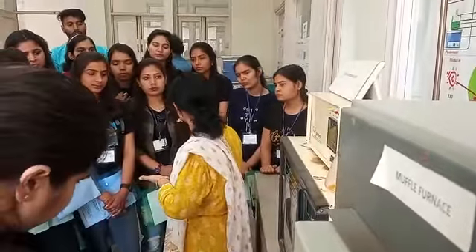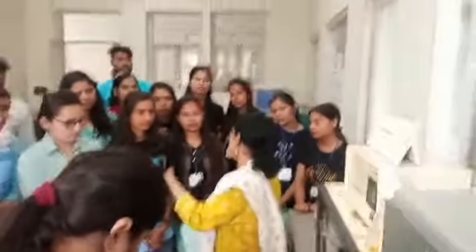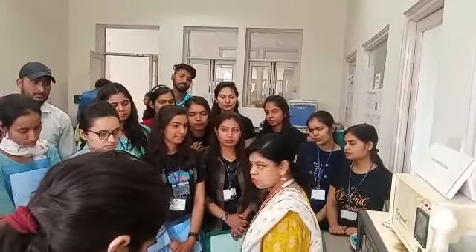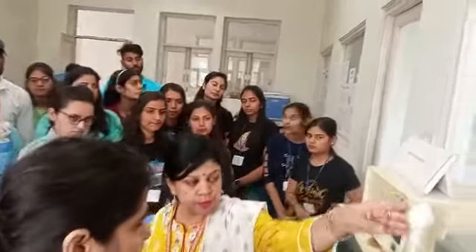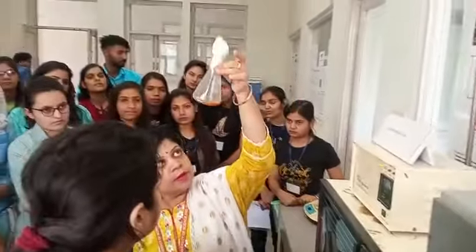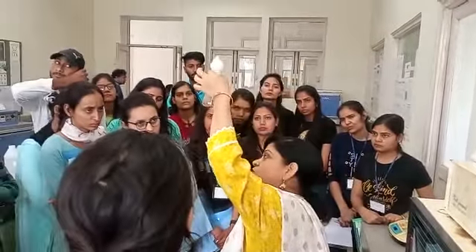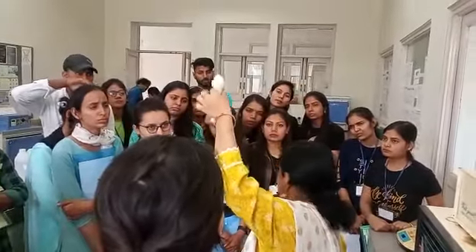For recrystallization purpose you have to add some drops of ethanol also in this. Okay, and when it becomes dry, you will get the product. You can wait. Clear? समझ में आ गई बच्चों? तो पहले का बना हुआ पड़ा है हमारा. दिखाओ. अभी इसमें turbidity आ रही है. It means after some time you will get the product.